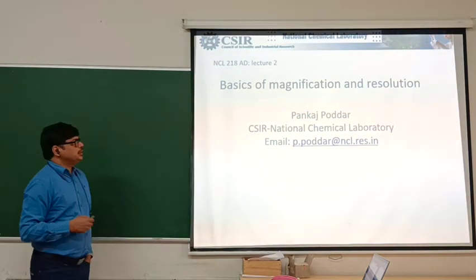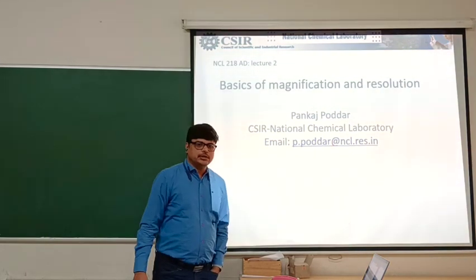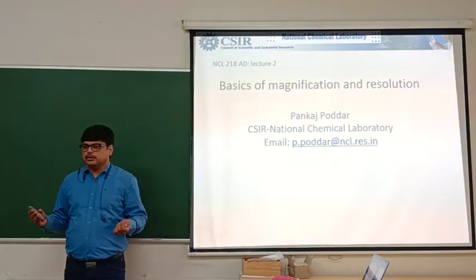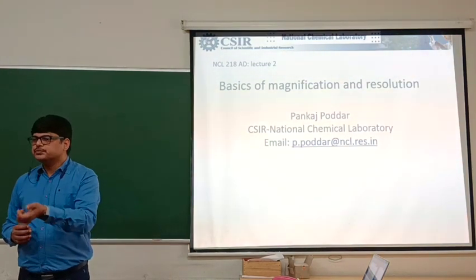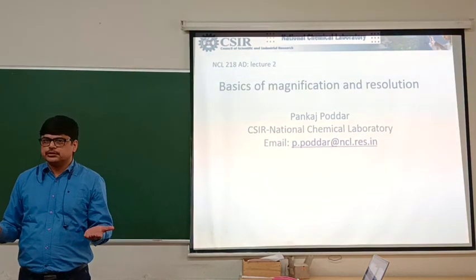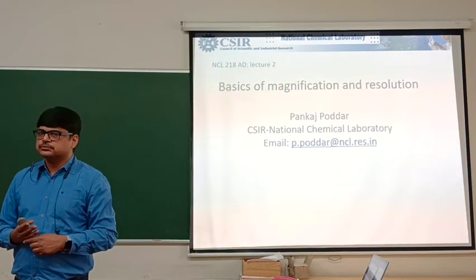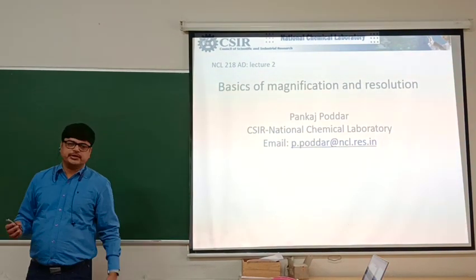Okay. So magnification and resolution, many times we confuse, right? In any microscopy, for example, we take an image, we magnify it. In your own mobile phone, if you just keep on zooming, beyond a certain point you start seeing pixels, right? Have you experienced this, Pragati? How many people have experienced this? That you take any image and you start magnifying it.